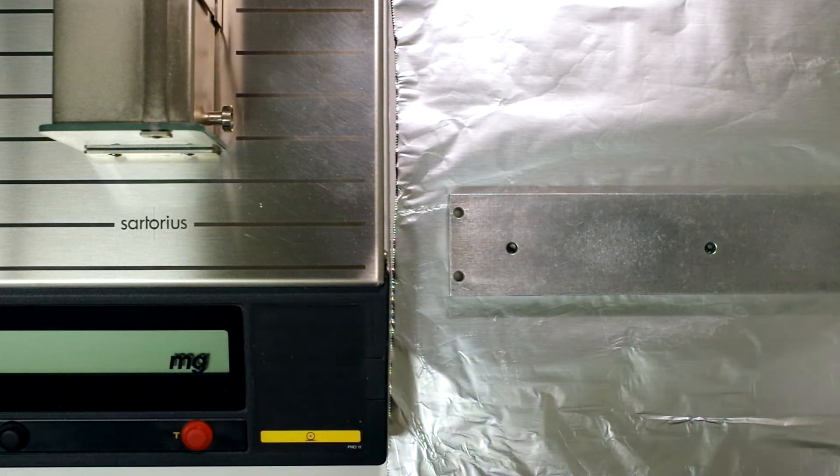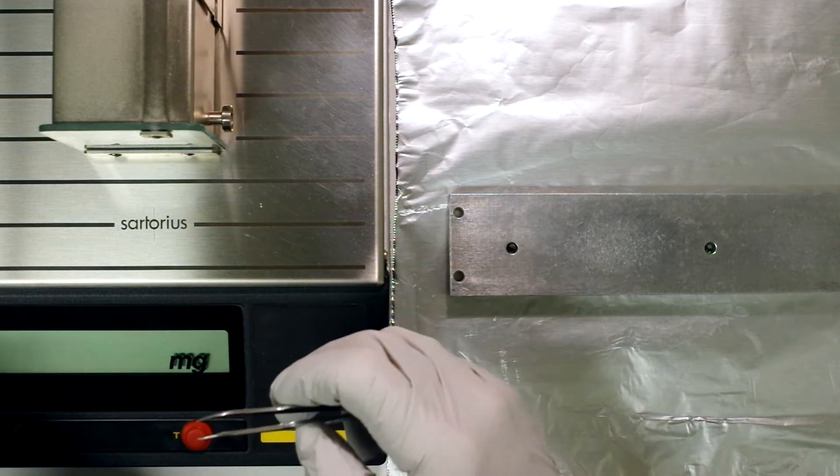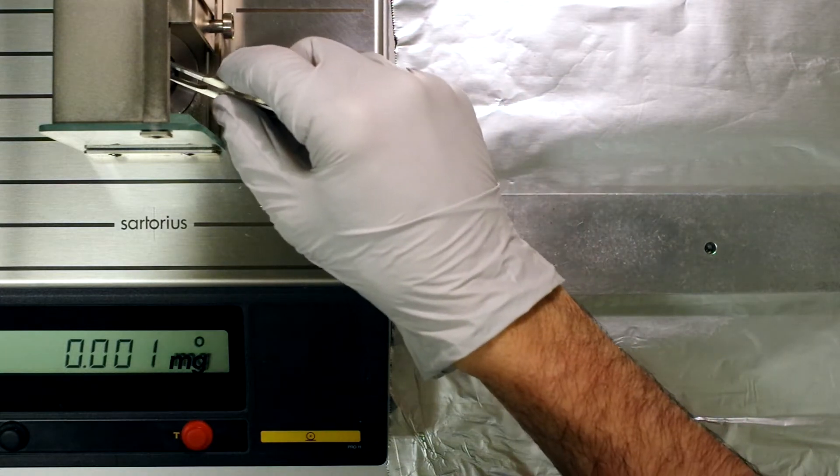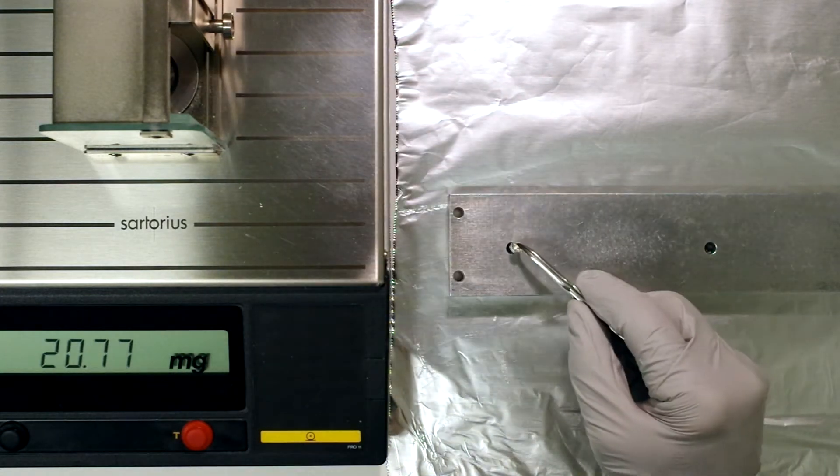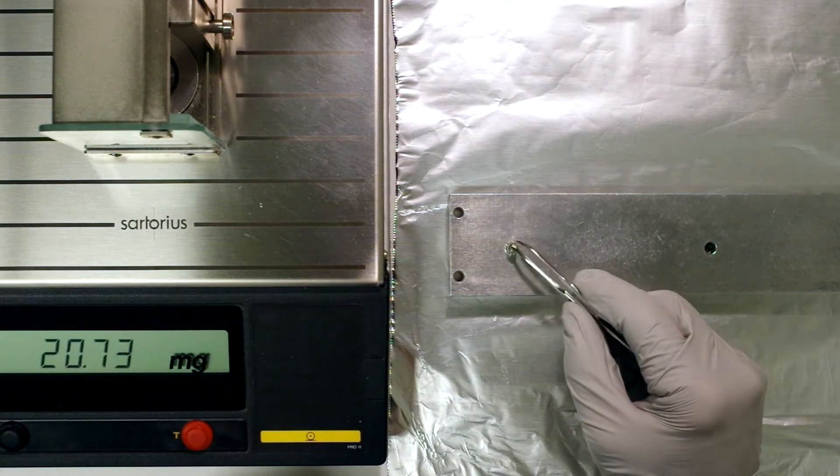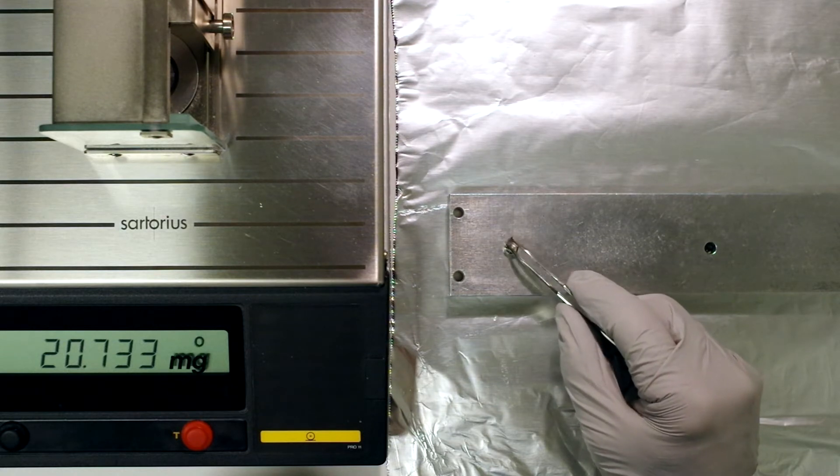And then I'm going to use our soil standard, which has about 2% carbon, so it's fairly low density. Higher density materials should pack in easier. But in this case, I'm going to try to get a minimum of 75 milligrams into the capsule.